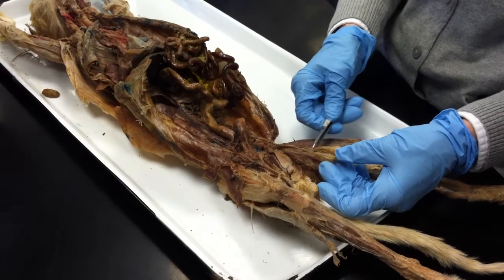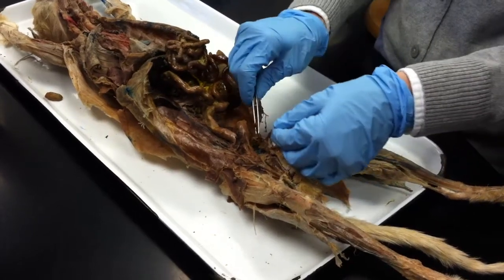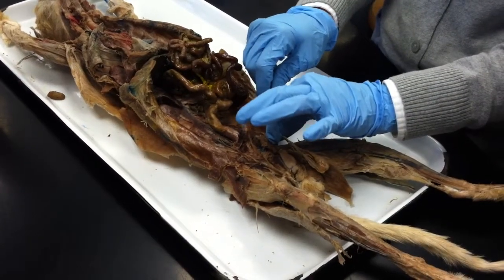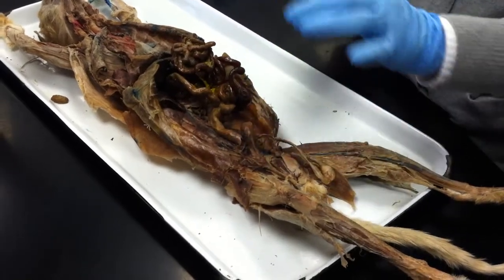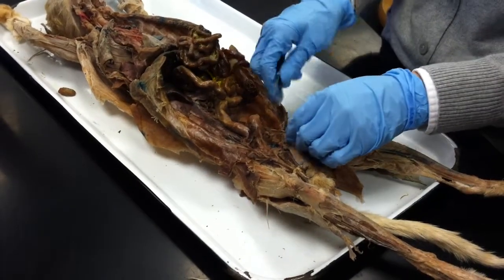That all leads up into the spermatic cord, which is here, which also includes the artery and the vein. And if it had any peritoneal membrane left, we would see that that spermatic cord has to come through into the abdomen. And sometimes where it comes through that membrane can rip, and you get an inguinal hernia when you have the intestines getting forced out through the hole out of the abdomen.